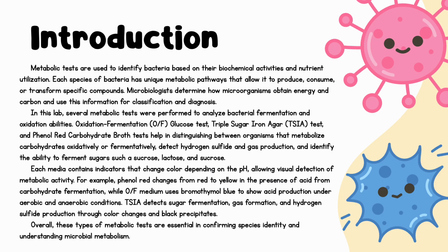Metabolic tests are used to identify bacteria based on their biochemical activities and nutrient utilization. Each species of bacteria has unique metabolic pathways that allow it to produce, consume, or transform specific compounds. Microbiologists determine how microorganisms obtain energy and carbon and use this information for classification and diagnosis. In this lab, several metabolic tests were performed to analyze bacterial fermentation and oxidation abilities.